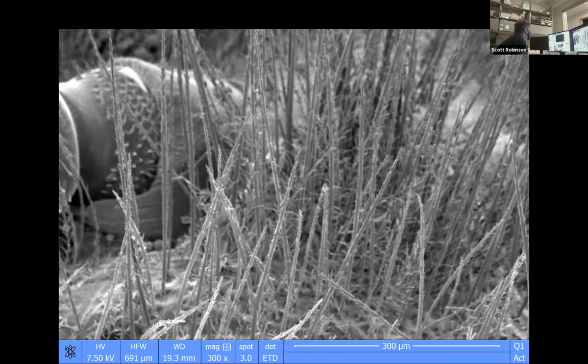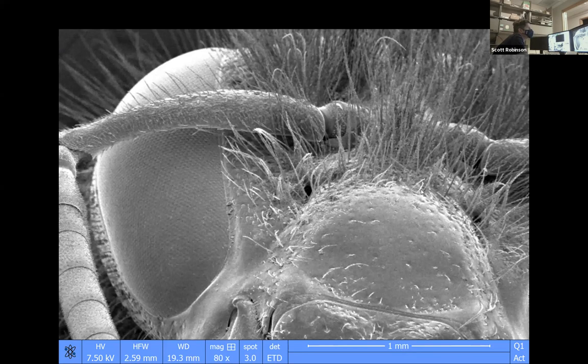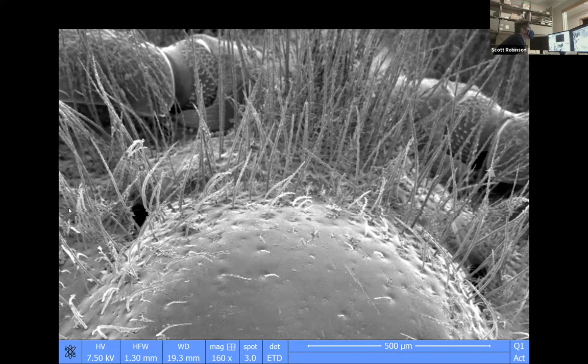We can tell if something is a bee if the setae are branched like this. So insects that are bees, or things that look like bees, that have branched setae, that's how we can tell what they are. No other kind of insect has little branches on these things that we're looking at, these little pieces.